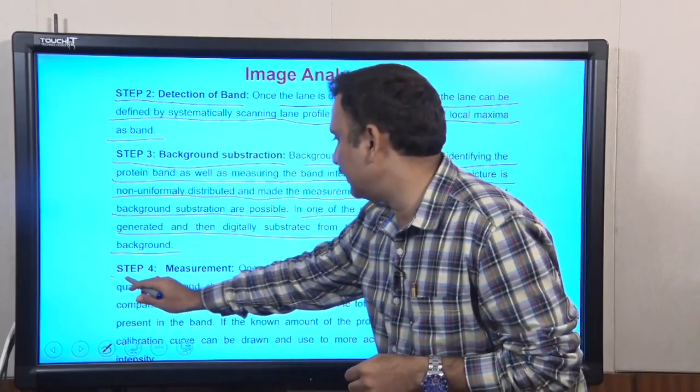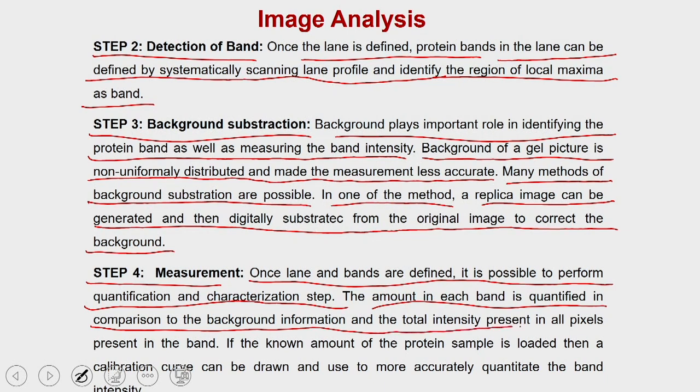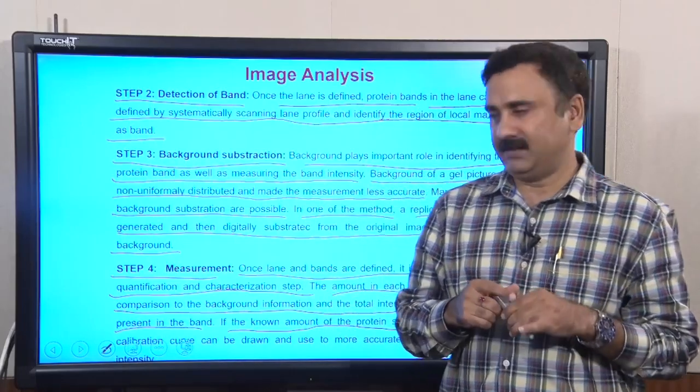And then you have to do the measurements. In step 4, once the lanes and bands are defined, it is possible to perform the quantification and characterization steps. The amount in each band is quantified in comparison to the background information and the total intensity of all pixels present in the band. If a known amount of the protein sample is loaded, then a calibration curve can also be drawn, and that calibration curve can be used to calculate the intensity in your band.